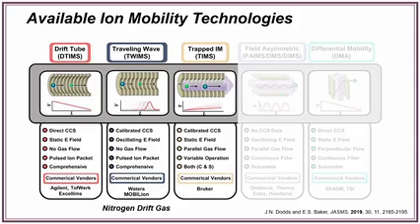The third style of ion mobility is the trapped ion mobility method, which is quite distinct from the other two. It's a backwards way of doing ion mobility. In the first two, your smallest ions come first through the drift tube. Trapped is the opposite. You're holding the ions in a trapping area and slowly letting them come out by dropping down the field in the trapping region.